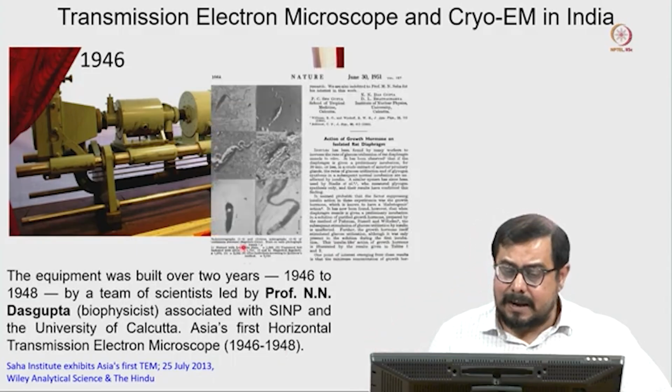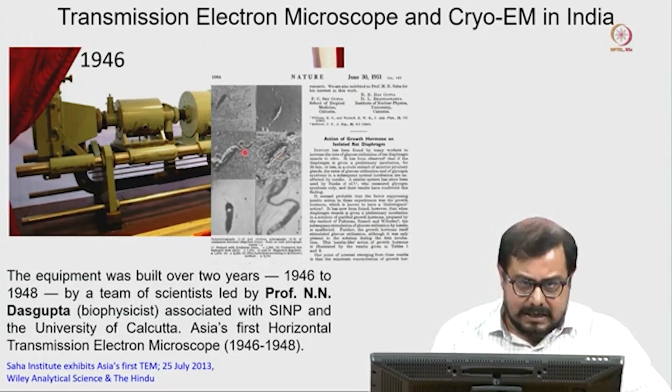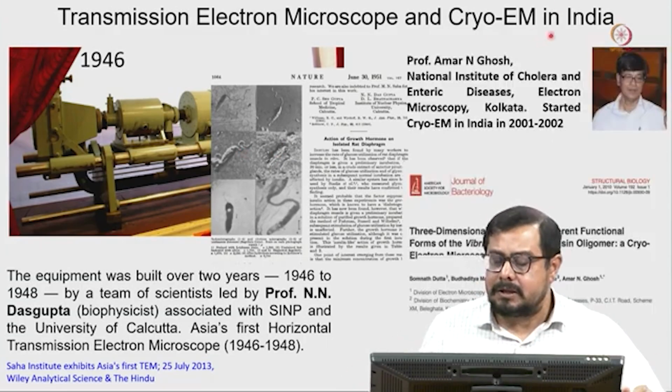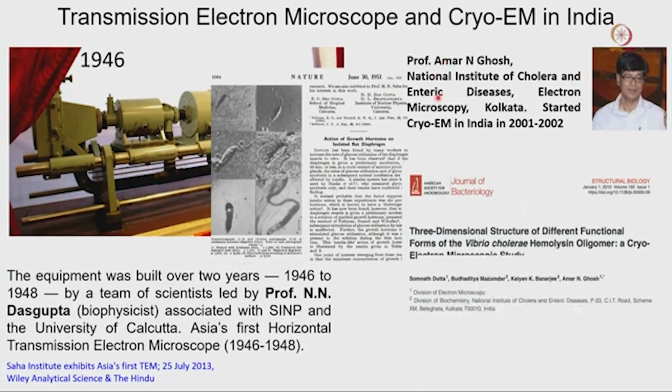There are a couple of papers published from this group, where they used this electron microscope and imaged different microorganisms. And Professor Amarnath Ghosh from the National Institute of Cholera and Enteric Diseases, Electron Microscopy Division, started cryo-electron microscopy in India in 2001-2002.